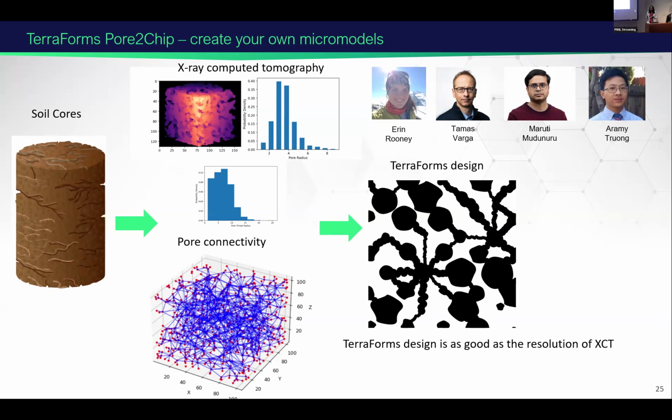We can make them using laser etching, which is really fast. Per chip probably will take around 3 minutes. However, if you want a resolution which is less than 15 microns, so if you want something like 2 microns or something, we will make these using photolithography, which takes time. So depending on resolution, it could be a really fast process or not. But it gives you the capability of mimicking parts of a soil core, and specifically the pore connectivity, which I think is really essential when studying nutrient transports, any kind of nutrient, carbon, or even other elemental transport inside of these pore spaces.